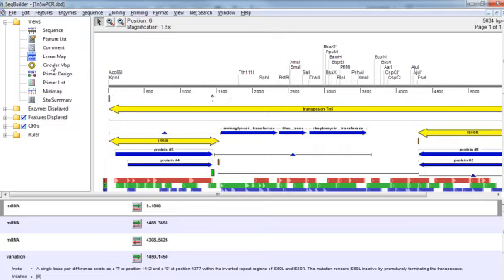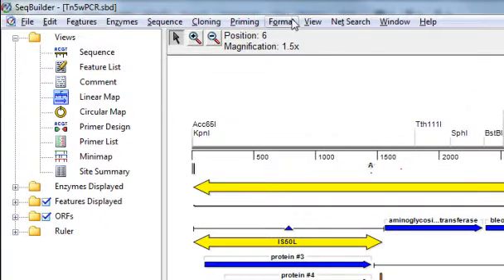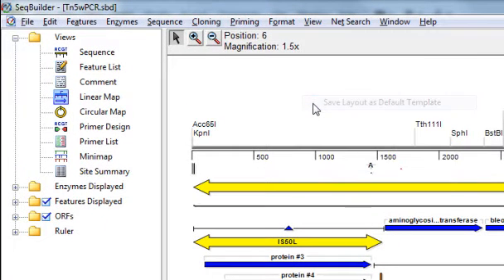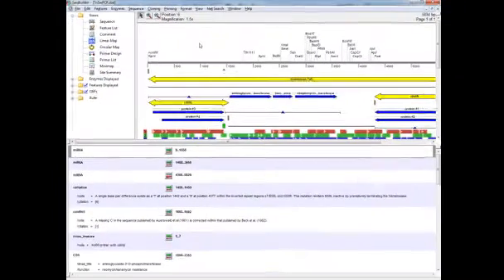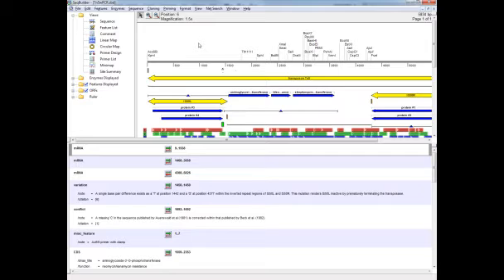Now, if you come up with a layout of the application window that you like, and you want to use it as your default layout, you can do that really easily just by selecting View Save Layout as Default Template. That will cause SeqBuilder to use your layout for every new SeqBuilder document. And that includes not only just the layout, but also the information displayed in the view, such as which restriction enzymes are displayed and whether translations or ORFs are on or off.